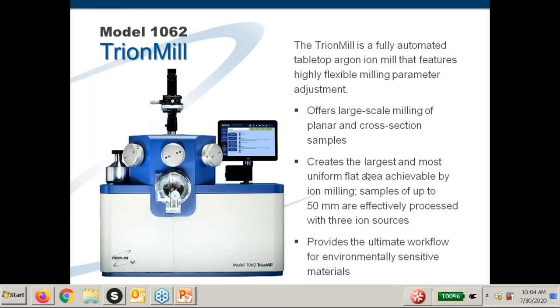This is the Model 1062 TrionMill. It is a fully automated tabletop argon ion milling system that features highly flexible milling parameter adjustment. It offers large-scale milling in both planar and cross-section samples, and creates the largest and most uniform flat area achievable by ion milling with samples up to 50 millimeters that are effectively processed, utilizing three ion sources. In addition to those characteristics, it provides the ultimate workflow for environmentally sensitive materials.